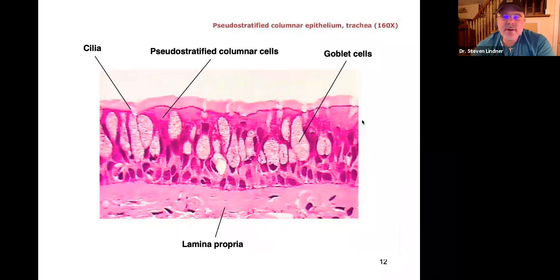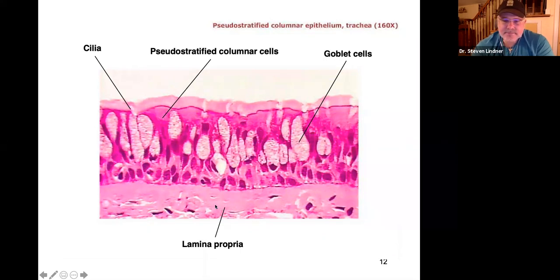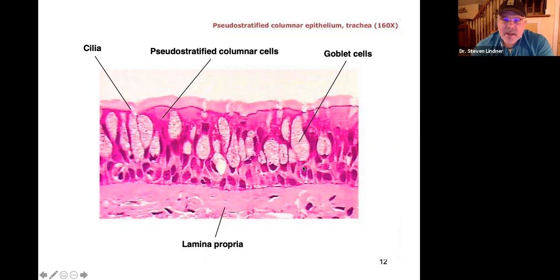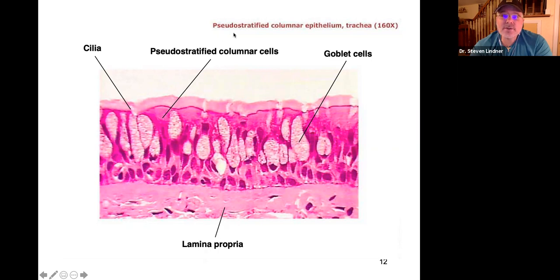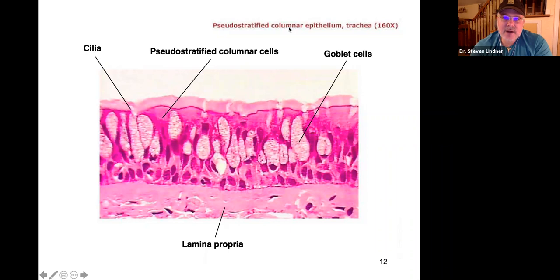These are definitely columnar-shaped cells. Here's the surface, and below is connective tissue acting as a basement membrane. There are lots of goblet cells, but the nuclei are scattered at different levels. You might want to say stratified columnar, but there's no such thing, so we call it pseudo-stratified columnar. Because there are cilia up here, we can be very specific: pseudo-stratified ciliated columnar epithelium. This is the trachea.